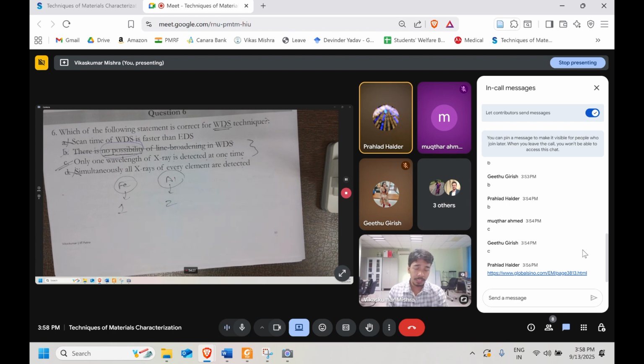From the EDS, you got to know which elements are present. Now in the WDS, you know what the reference single crystal is. Based on that, you will try to find the theta. So now you can get a different angle. You will do it in a sequential manner, this much amount of this, that, and that. Like that we are going to do.